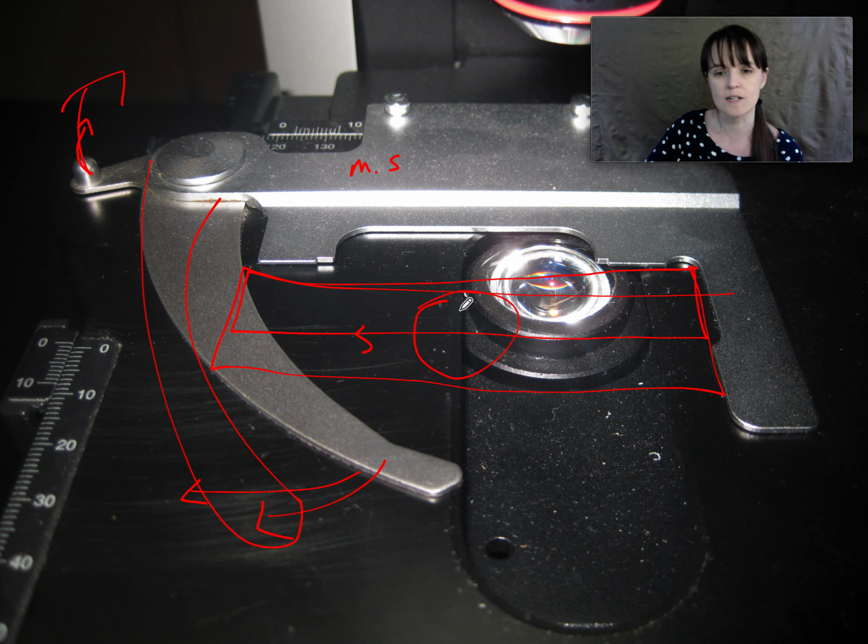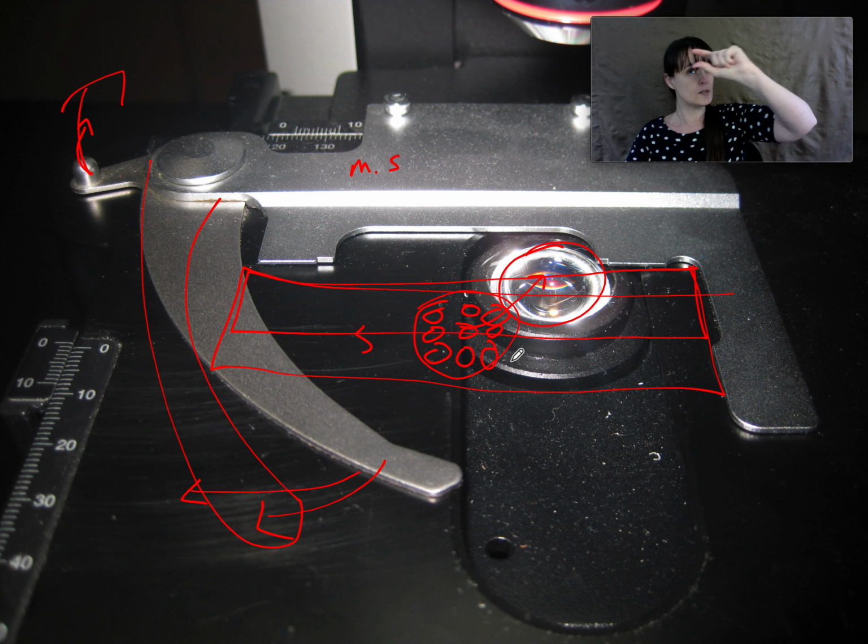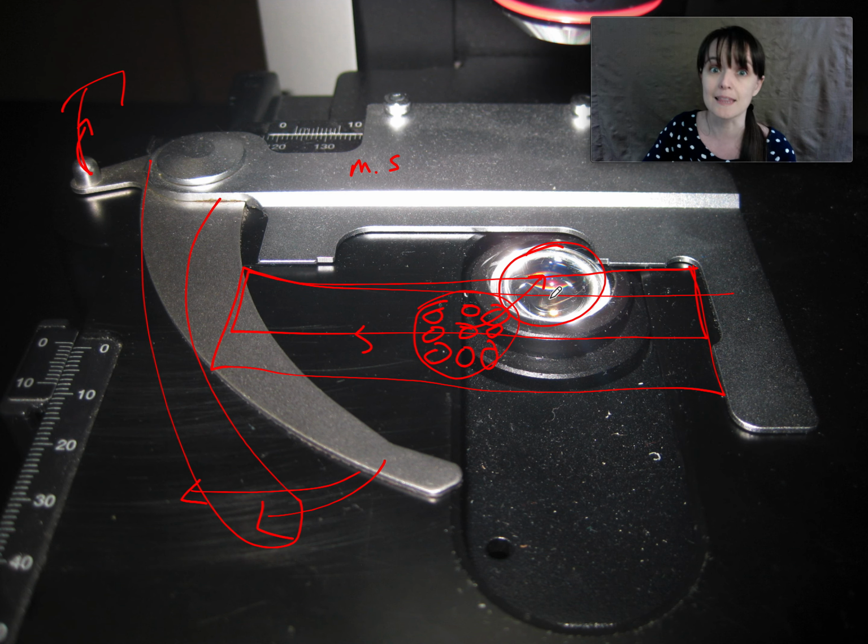And then you see how our specimen here is not lined up, so we will use the mechanical stage controls to move the specimen over the light, or you won't see anything because there's no specimen there to see. And some of the specimens, especially at the very beginning of the class, are really faint, like little pink circles that you can barely see with the naked eye. So what I like to do is hold them up to the light in the room and find exactly where they are so that I can line them up with the substage light.